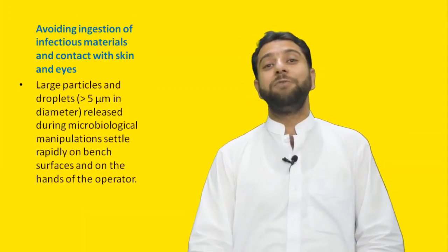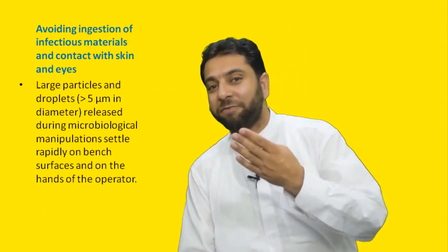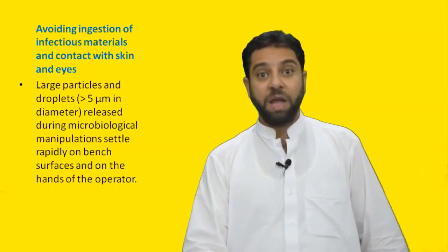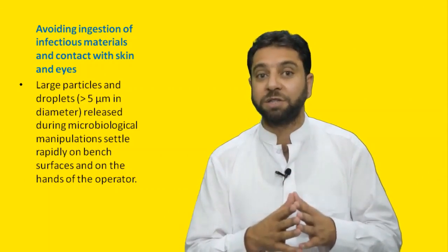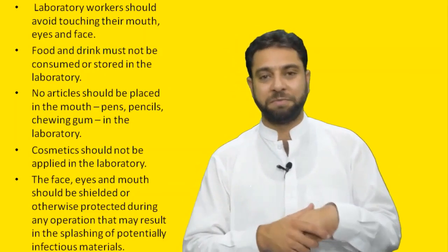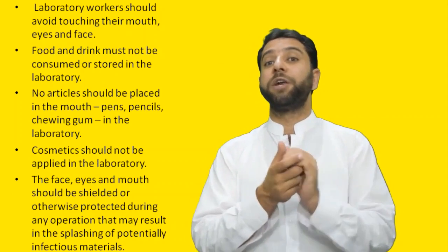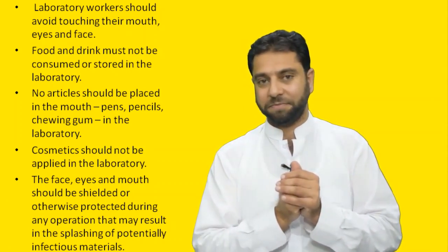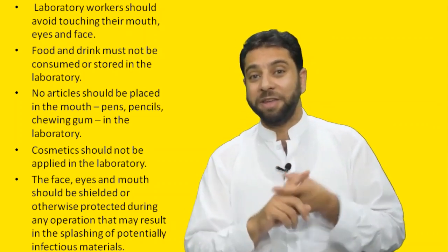Now, how can we avoid ingestion of infectious materials and contact of infectious materials with skin and eyes? Remember that large particles and droplets released during microbiological manipulations settle rapidly on bench surfaces and on the hands of the operator. Therefore, disposable gloves should be worn. Laboratory workers should avoid touching their mouth, eyes, and face. Food and drink must not be consumed or stored in the laboratory.